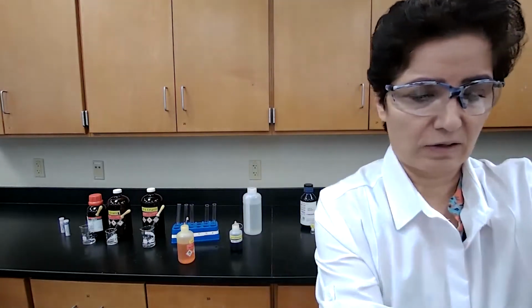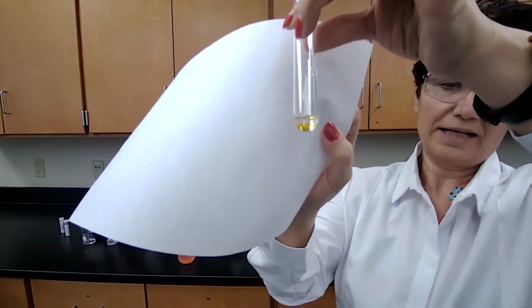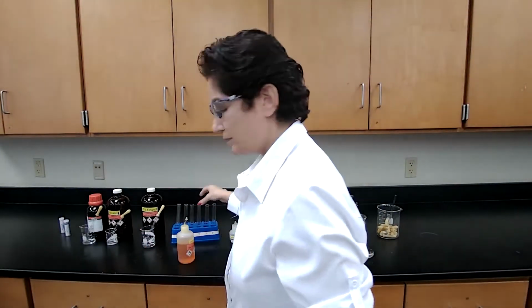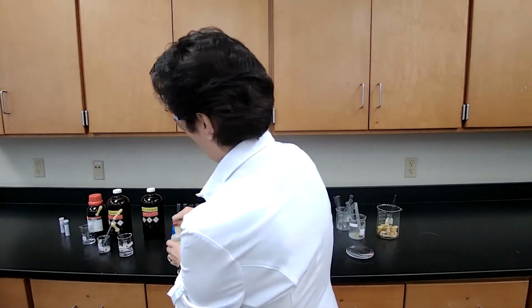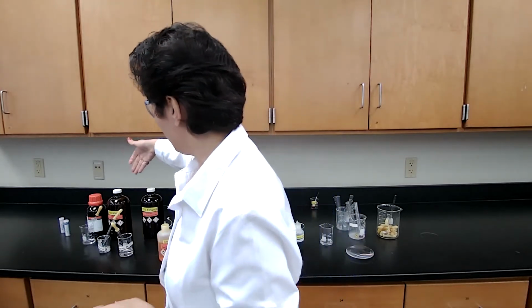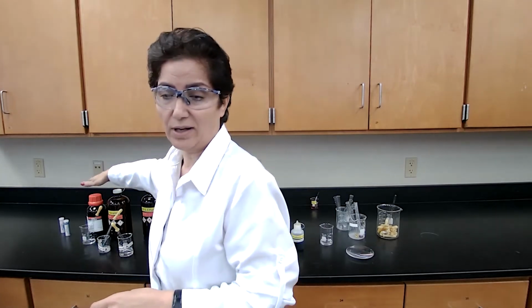We have this also a yellow color, which is the negative test for ceric nitrate, no alcohol. Okay, we finished the test for the known solutions with the ceric nitrate. So we already know that ethanol was alcohol, hexane was not alcohol, and pentene was not alcohol based on the ceric nitrate test.